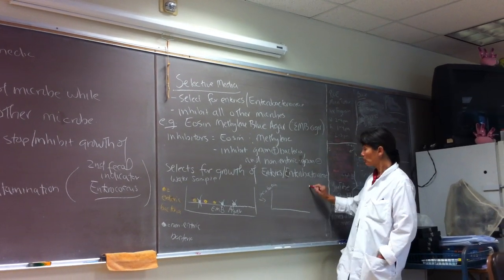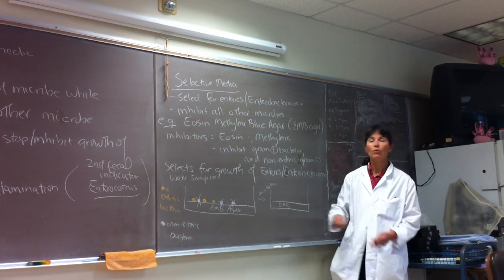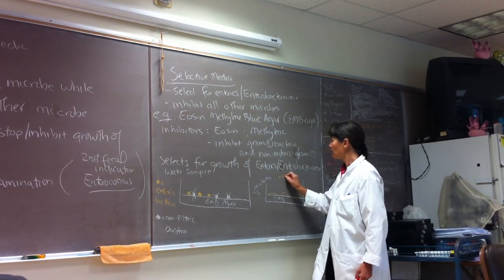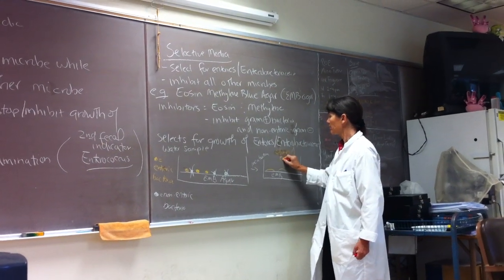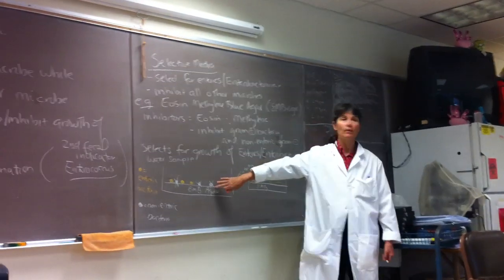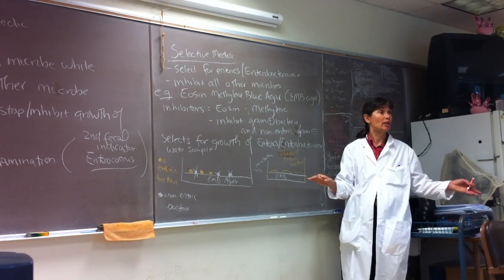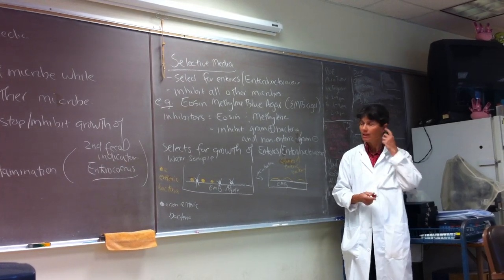So after incubation, when we pull those plates out, we should only see colonies of what? Enteric. Yeah, we selected for the growth of those enterics. So we would expect that the colonies should be colonies of the enteric bacteria, because all the other free-living bacteria were inhibited. They weren't permitted to grow. Okay. So that's this concept of selecting for the growth of one group of bacteria by inhibiting all the others we're not interested in. And it makes screening samples, food, water samples, much faster, easier.